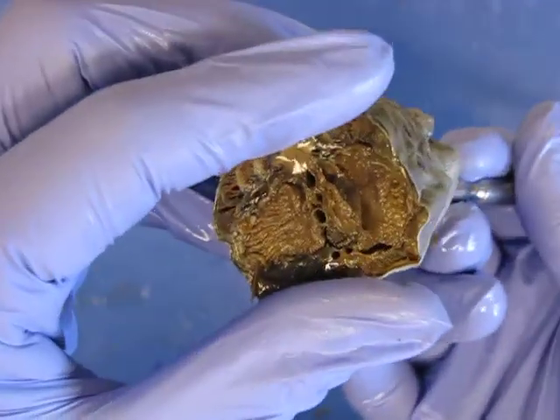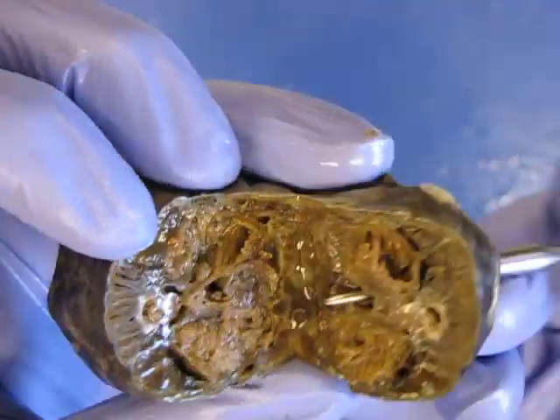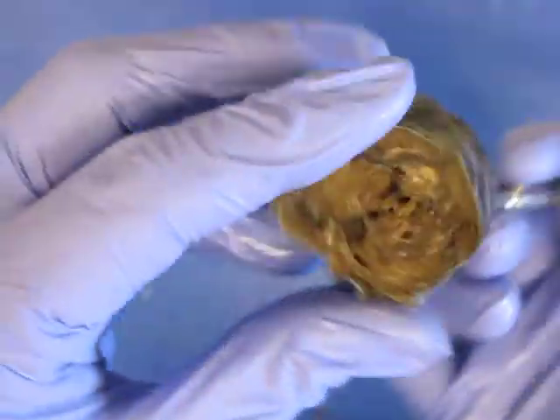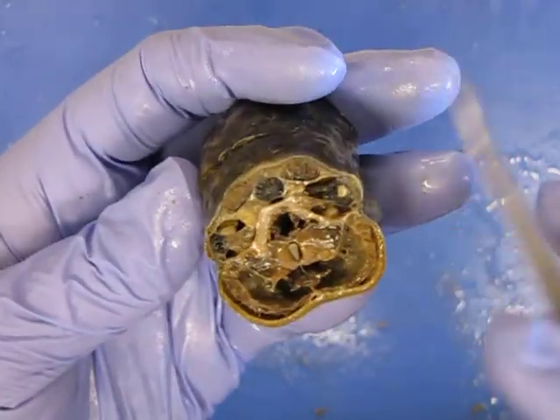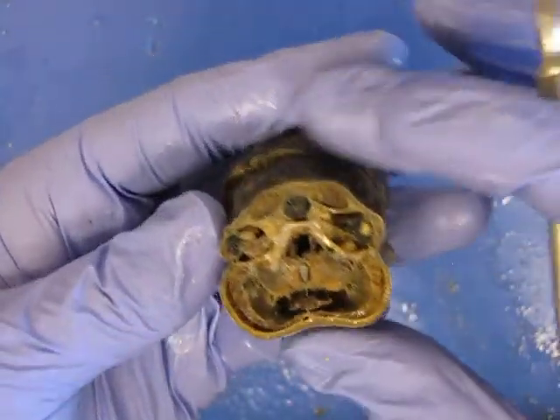Pharynx into esophagus. I cut this one slightly here. Okay. Just can't see the notochord yet because we're not caudal enough yet to see the notochord.